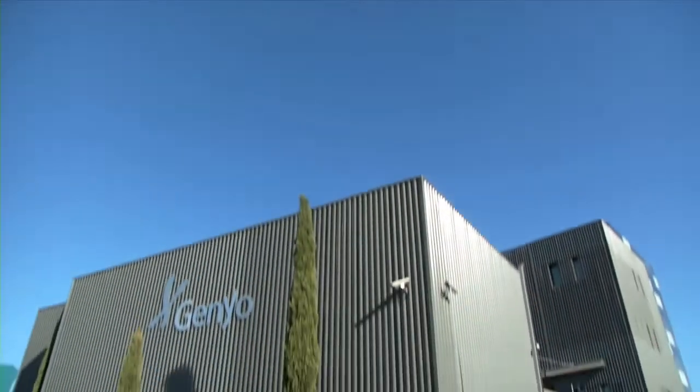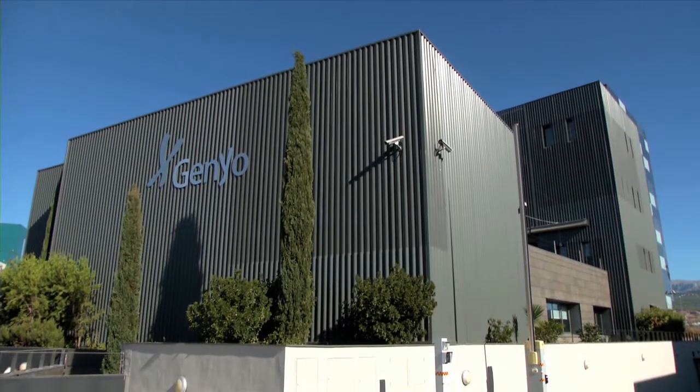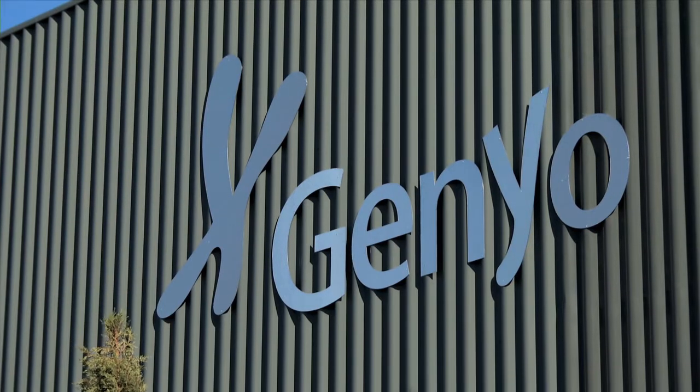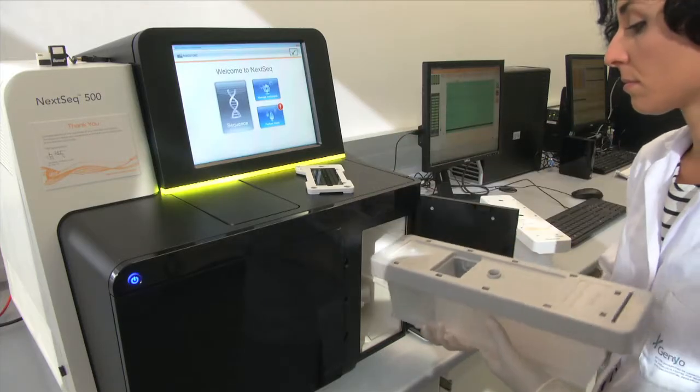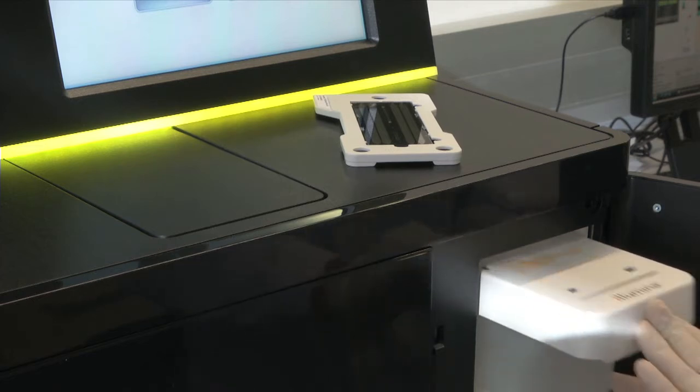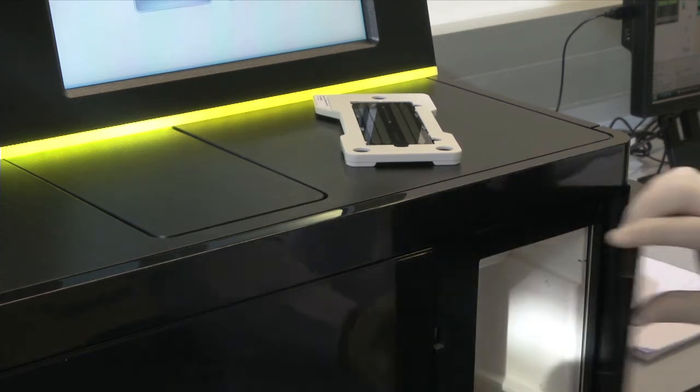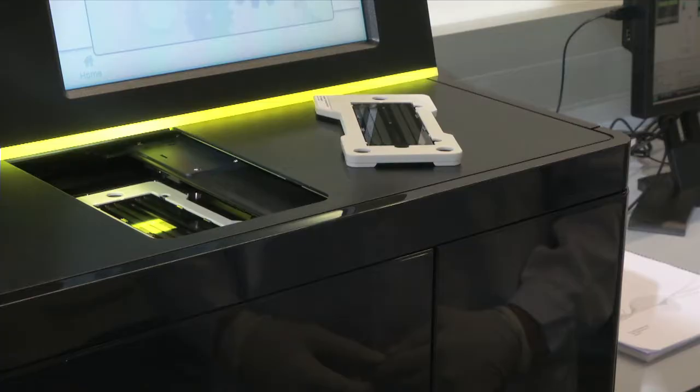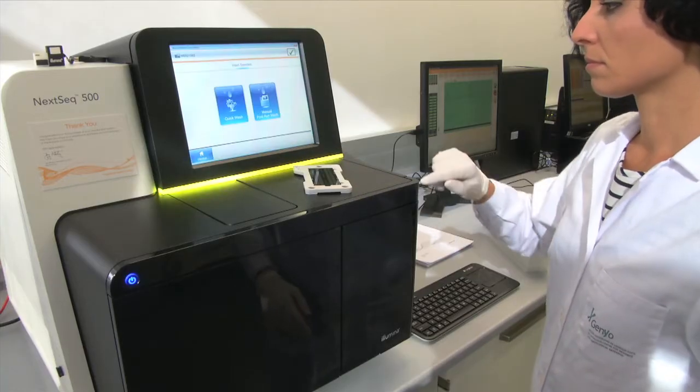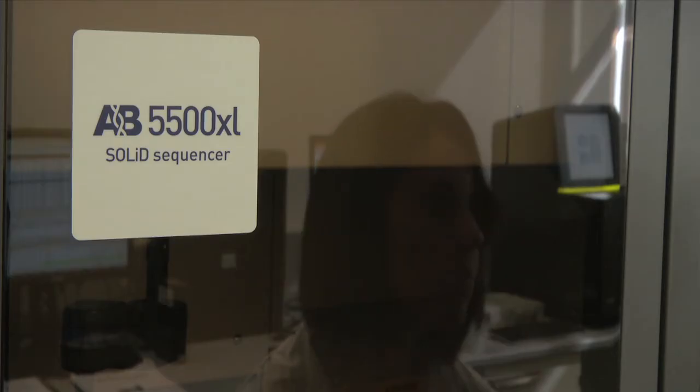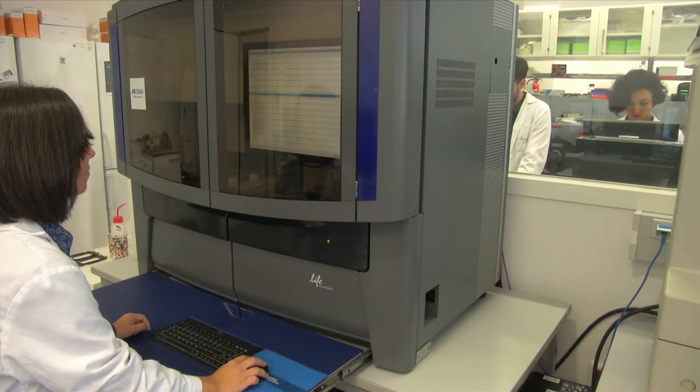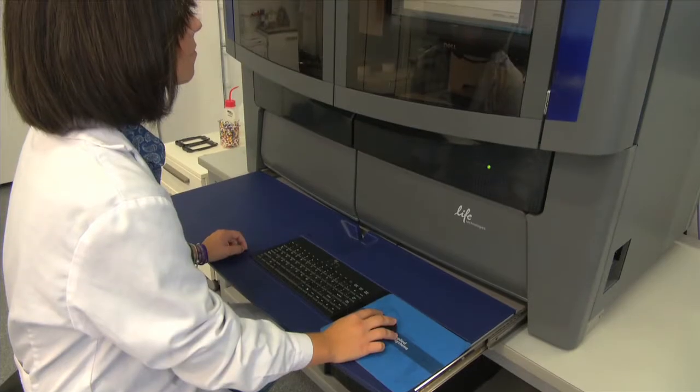This research center has the latest technical equipment for efficient developments for both internal groups and projects of external users. Among other technological platforms, it has two sets of next generation DNA sequencing systems such as NextSeq from Illumina and SOLiD 5500XL from LIFE, capable of sequencing a whole human genome in a few days.